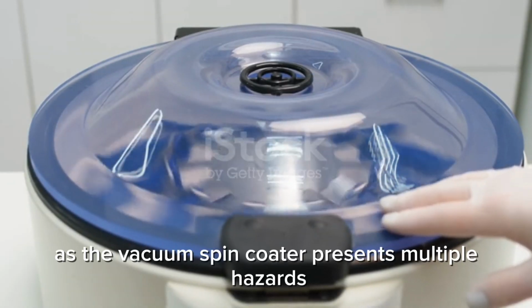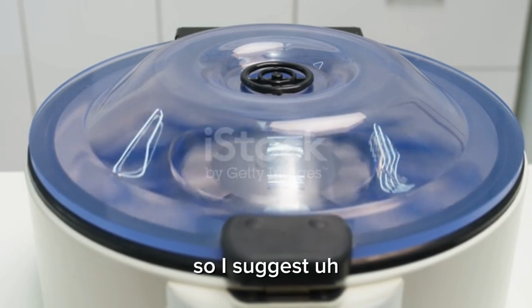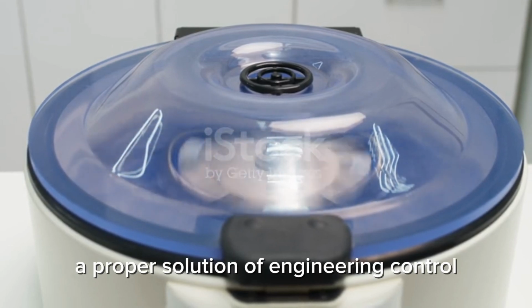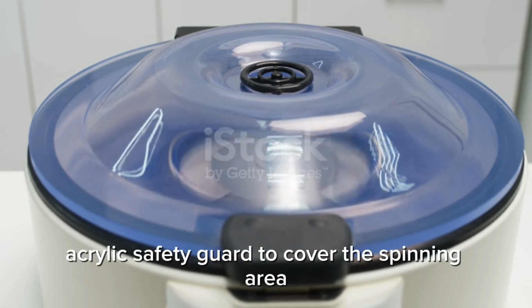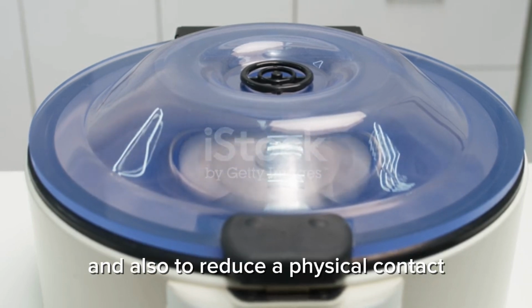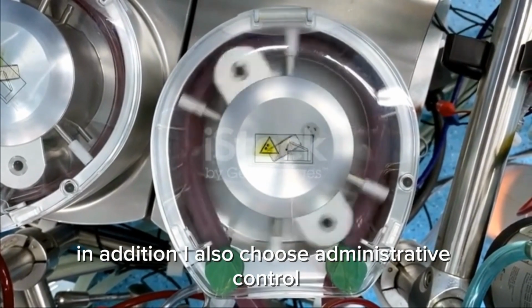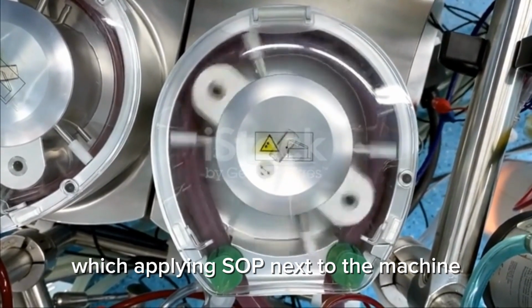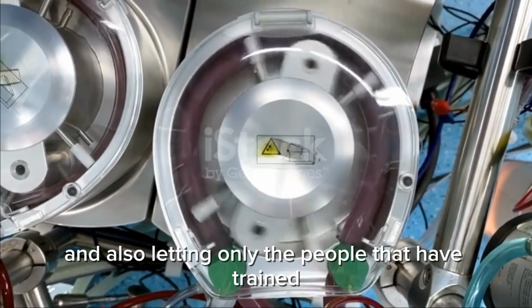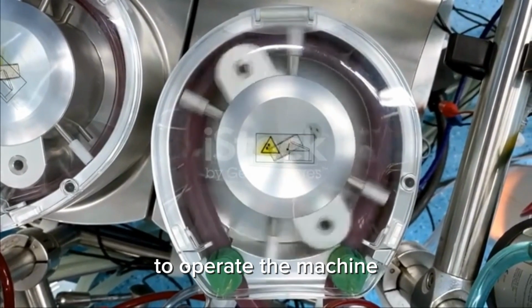As the vacuum spin coater presents multiple hazards, I suggest a proper solution of engineering control. I designed a transparent acrylic safety guard to cover the spinning area and also to reduce physical contact. In addition, I also choose administrative control, which is applying an SOP next to the machine and letting only the people who have been trained operate the machine.